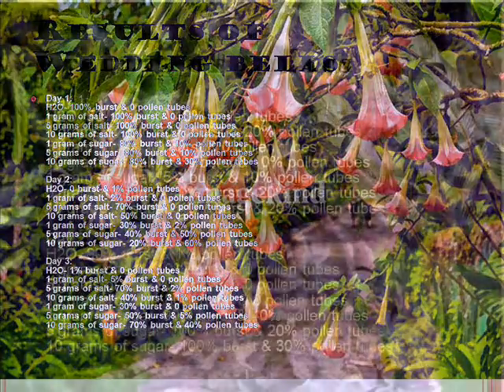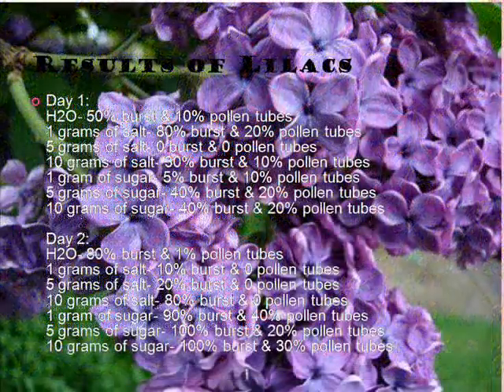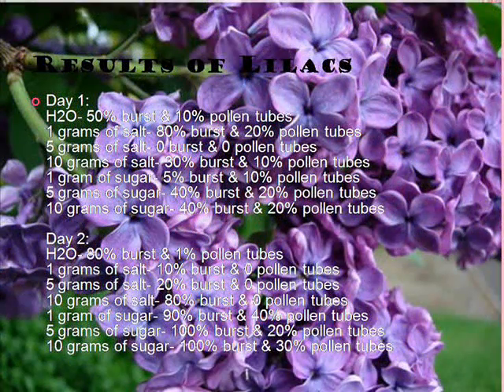Now for the result of the lilac. They were in the medium section. There was more bursting than pollen tubes, if any, over the course of the week that we tested about 6 lilacs.